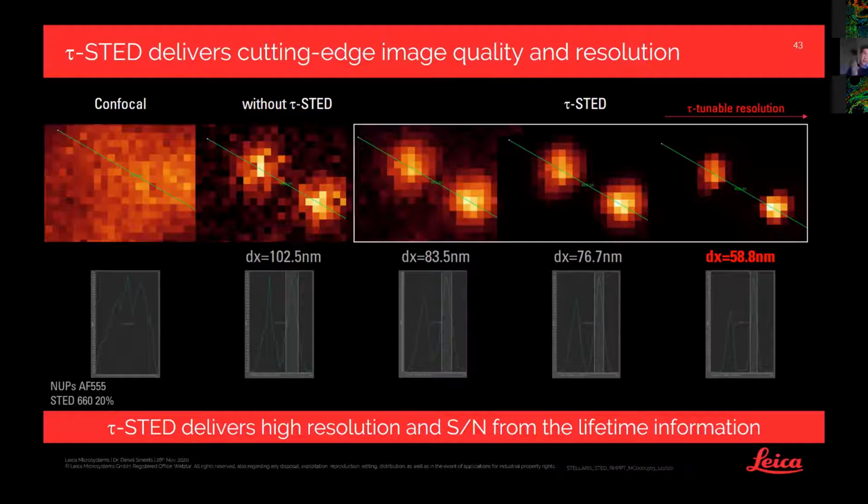There you could make like a steep cutoff and also throw away mainly the background photons. But if you then wanted to change something, you had to go and make a new acquisition. So there was no way to do that in post-processing then.